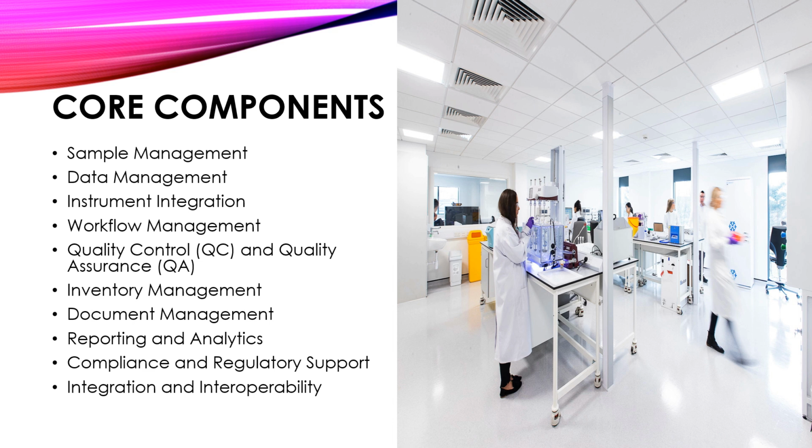Workflow management. A laboratory management system optimizes laboratory workflows by defining and enforcing standard operating procedures (SOPs), task assignments, and priority settings. It helps in organizing and scheduling tasks, managing work queues, and tracking the progress of experiments and analysis.